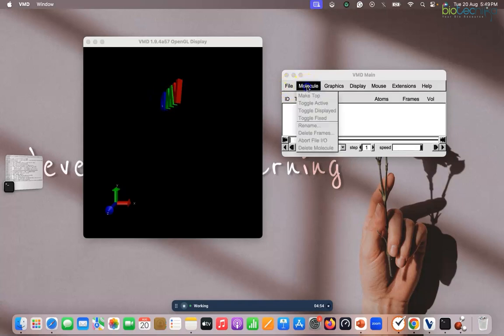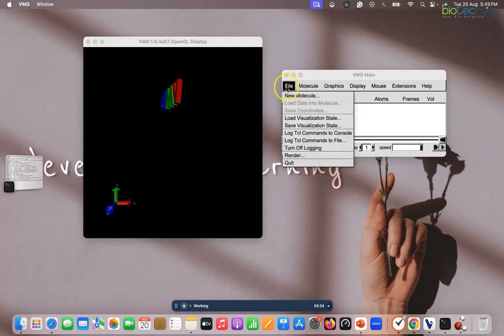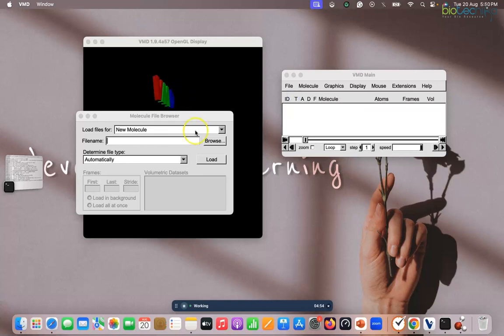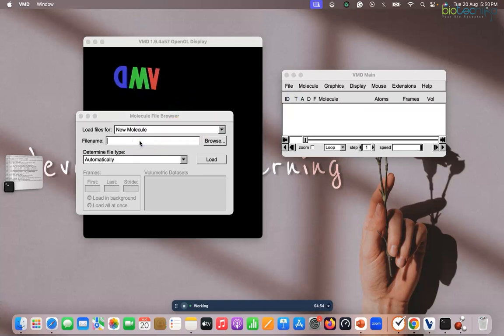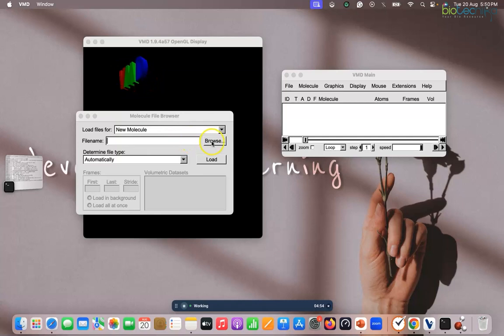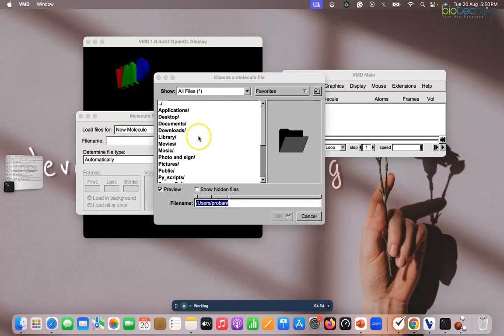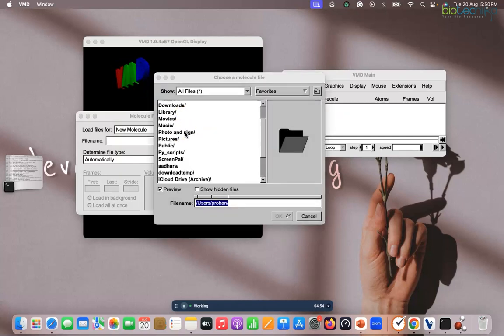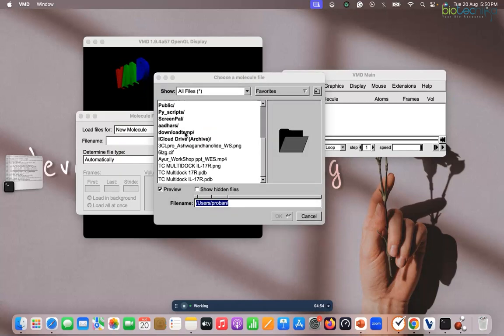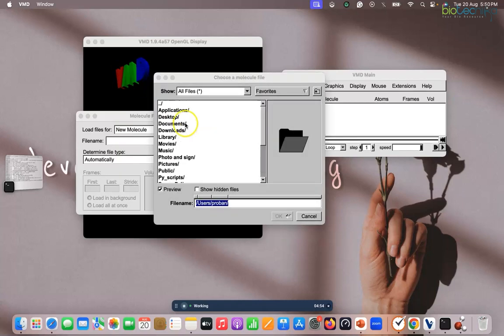I will go to the molecule, or maybe file, file and load a new molecule. And in this new molecule I can select the file name. I can go to browse and if you have the location in your mind, so directly you can click. You can go to desktop or wherever the file is located you can go to that.